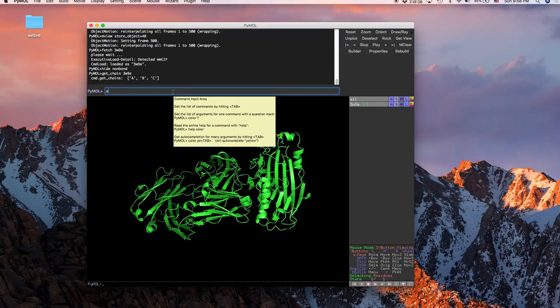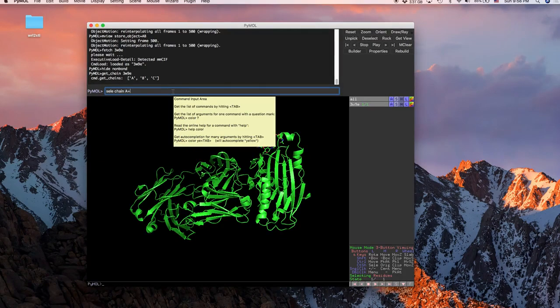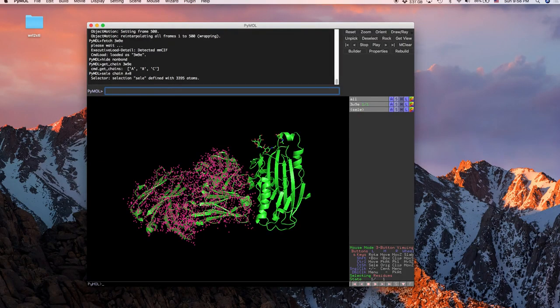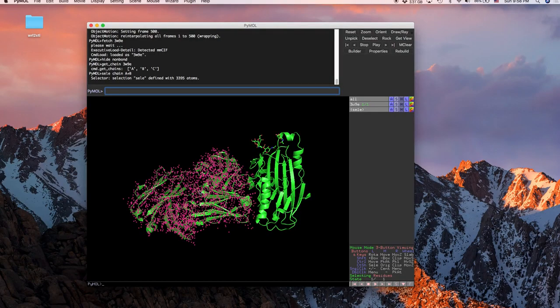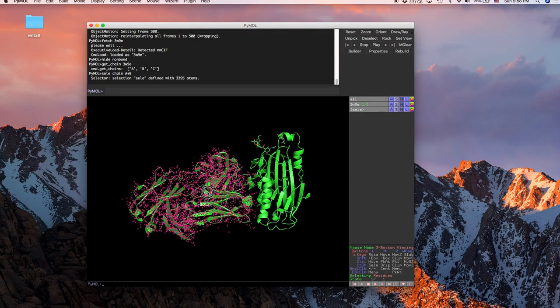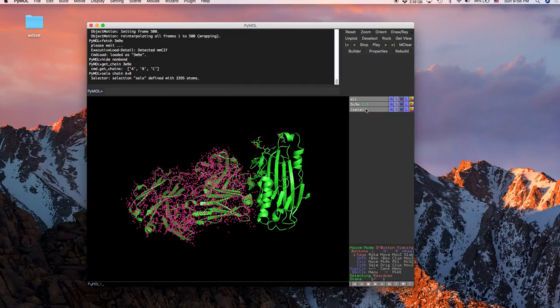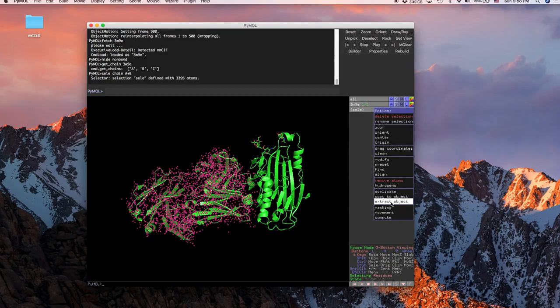So if we do sele for short for select and then chain a plus b, so here is one of the molecules that I'm going to want to show docking into this one. So right now this is what we have selected, so we're going to go to action, extract object, and then we'll get this object one here.